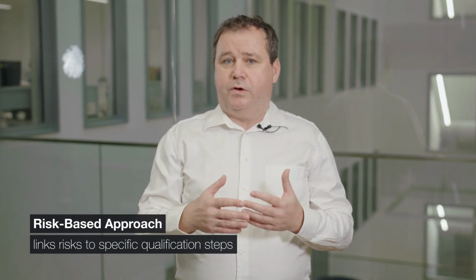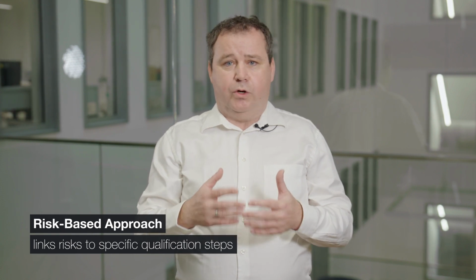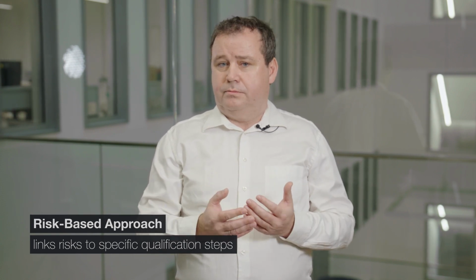Georg, how do you do it at Anton Paar? We do it exactly the same way. The risk analysis is valid when all possible errors are known for the instruments and their effects are dedicated to a specific qualification step in the IQ, OQ and PQ.